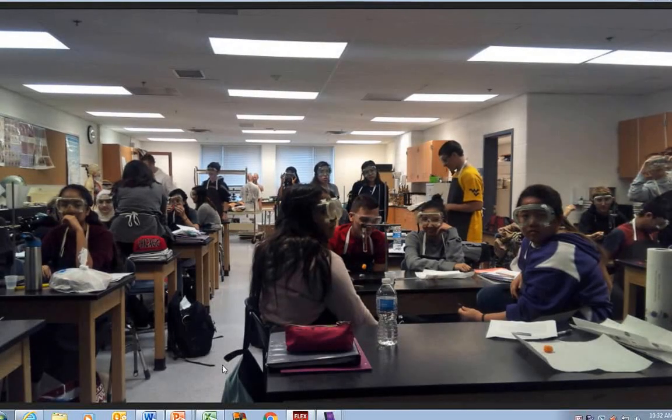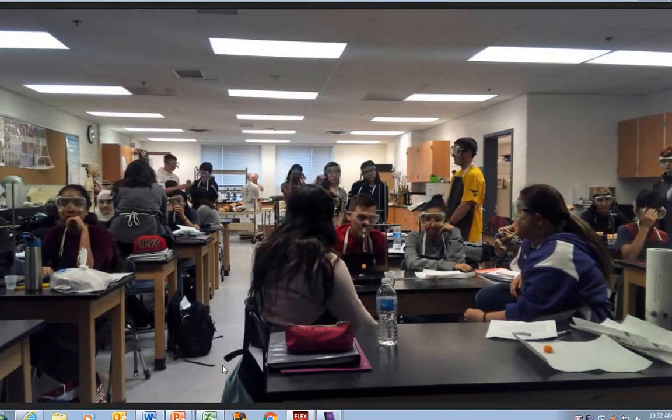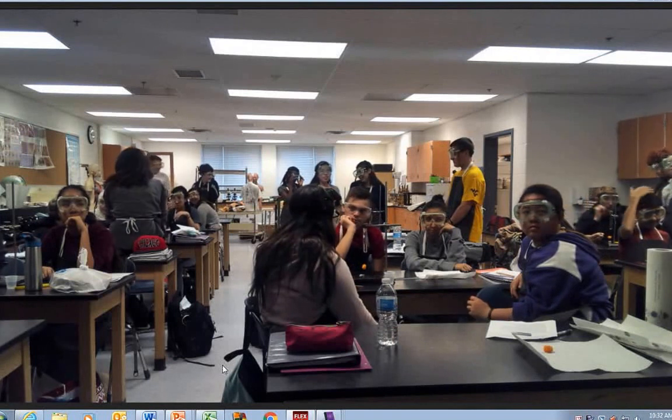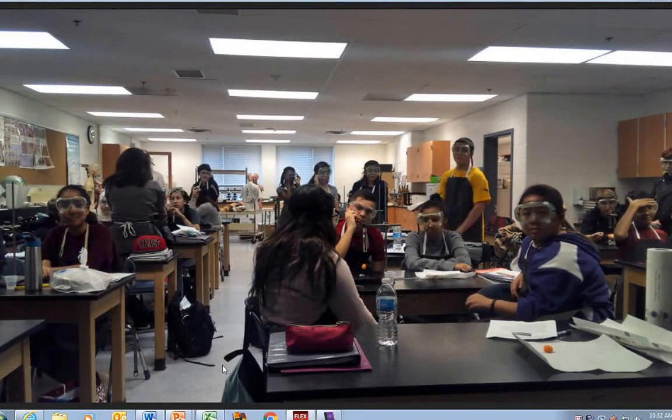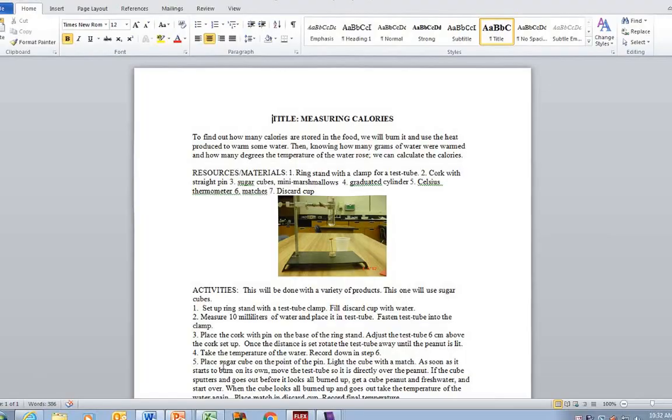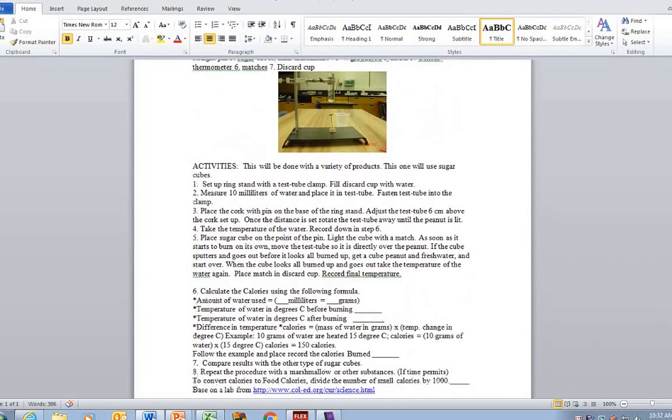What we're going to do is measure how much calories, how much energy, transfers from your little cheese ball when you ignite it to increase the temperature of water. What we're doing is a standard lab measuring calories. You can actually calculate it because the density of water is one. You can see the amount of energy it takes — the quantity of energy — if you raise the temperature one degree Celsius, that is what a calorie is.